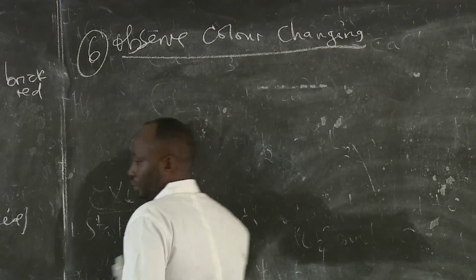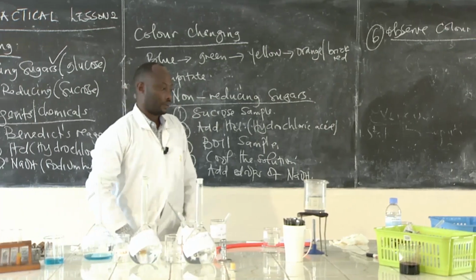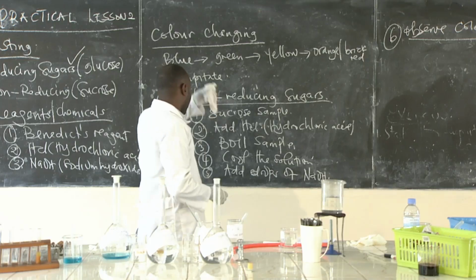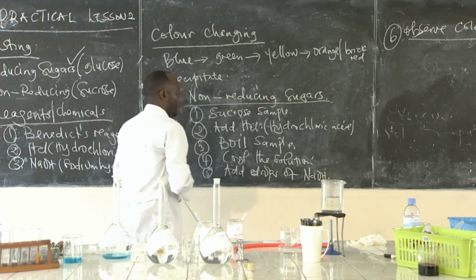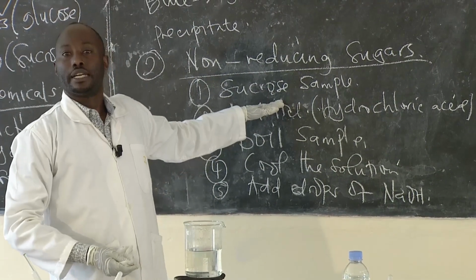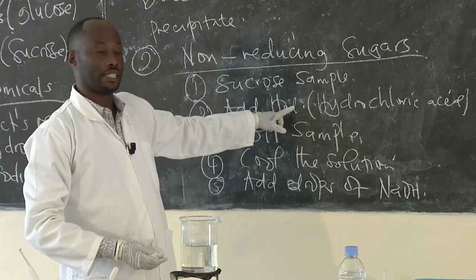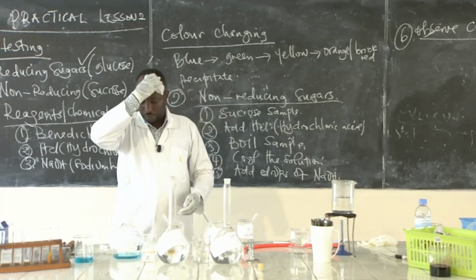Let's try to do the practical now. There is something we also have to talk about. We also have to remind ourselves, why do I have to add sodium hydroxide? I add sodium hydroxide to the solution purposely to neutralize the acid present in the solution. Let's now do the practical.